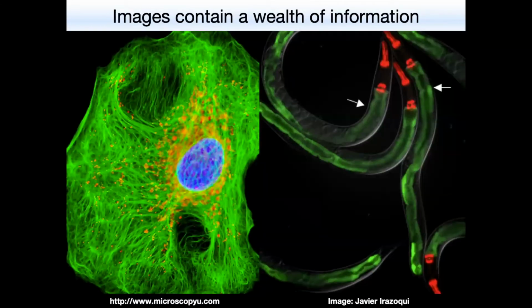As we know, images contain a lot of information. You often have millions of pixels per image, and pixels carry digital values. When you have multiple channels, sequences and time points, that gives you a very large set of information, on the level of the richness of information that you could get from the genome, with the additional benefit that you can get information about spatial organization and see which structures are present in which individual objects.